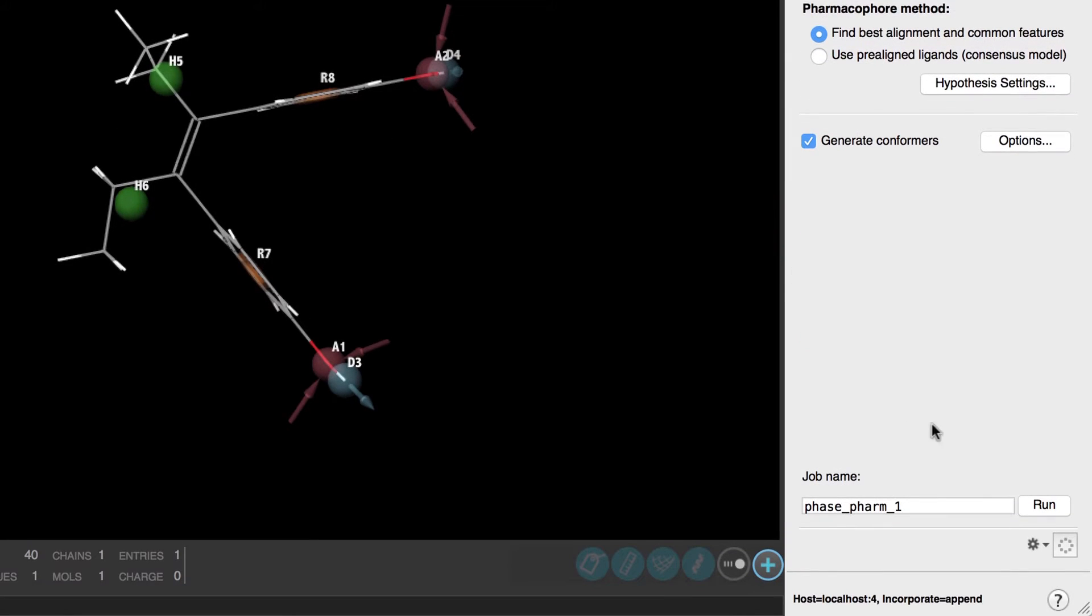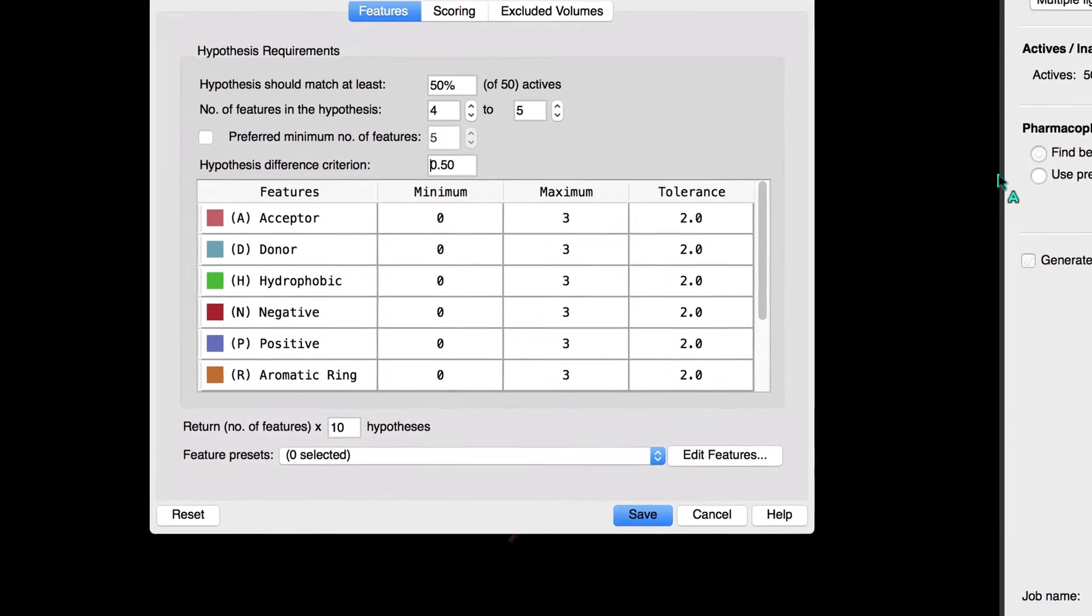Now we could click run to start the job using the default settings but let's make a few changes. Let's open the hypothesis settings.